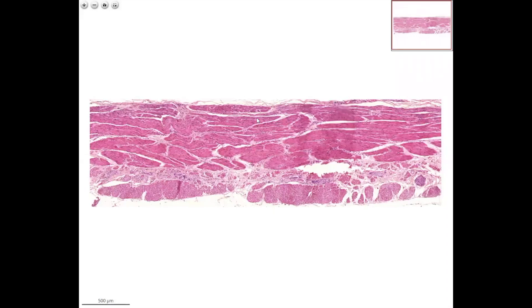Smooth muscle, longitudinal cut and transverse cut with HND staining. Please note that all theoretical details of the smooth muscle final structure you must learn from the lecture material and from your textbooks. Here I will demonstrate only the facts that you can see in the slide. This piece of tissue was taken from the wall of the small intestine, but the mucous membrane was removed, so you only see the two layers of muscles in two different cuts.